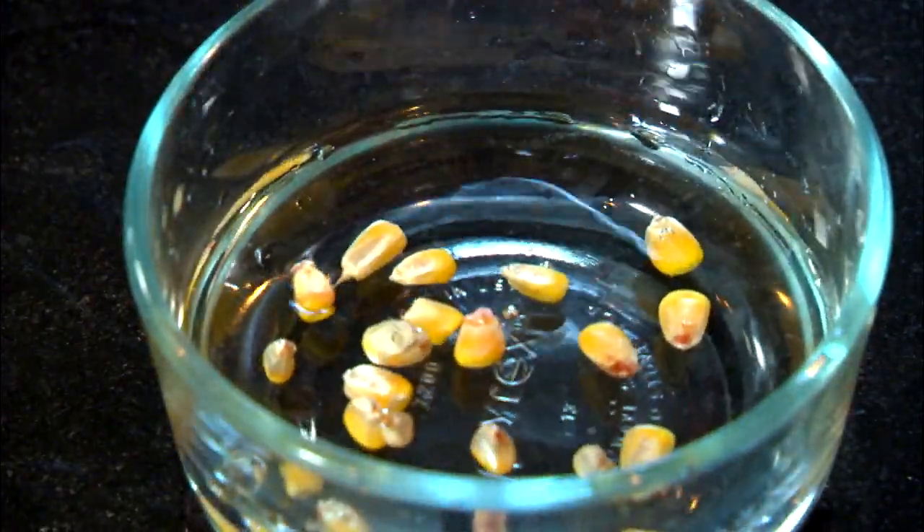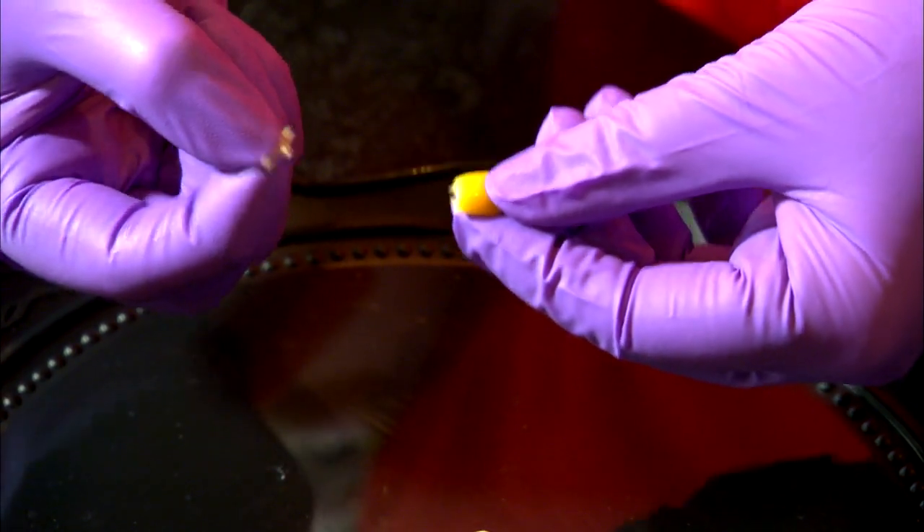Now, let's find these elements. Soak your dried seed for 48 hours to soften the tissue. Use your fingernail to pull off the tip cap of the seed.